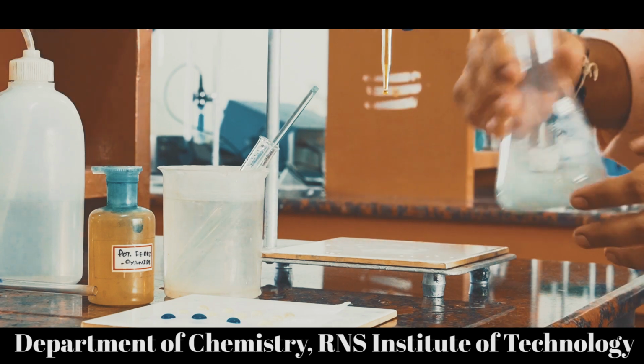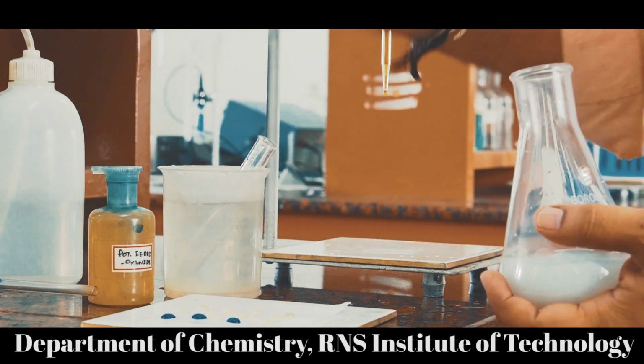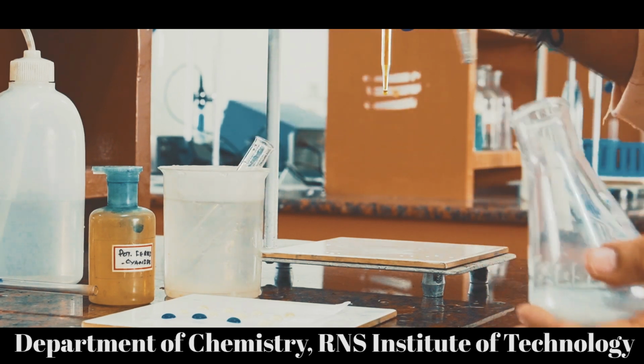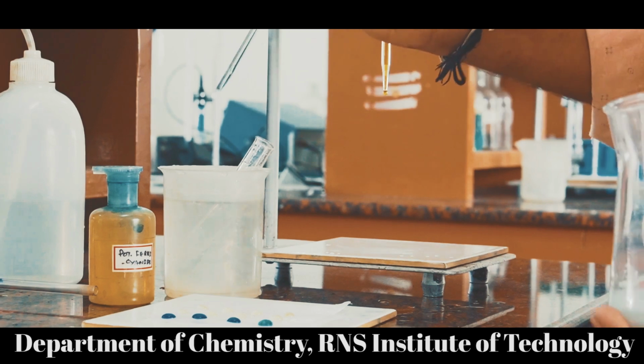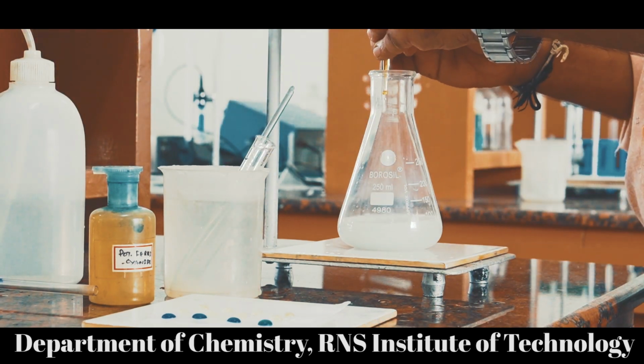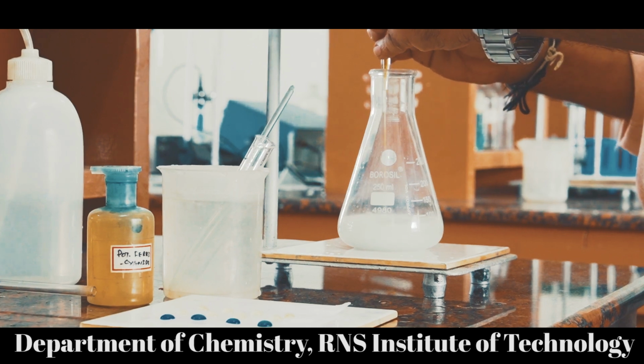Now added up to 10. Again we have to check. So like this. See, it is coming. Okay. So we need to add 1 more ml, that is up to 11.